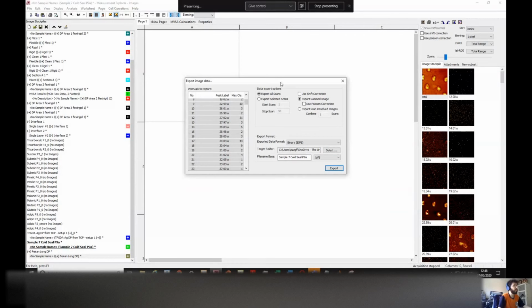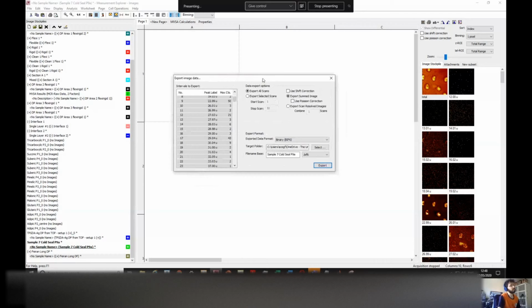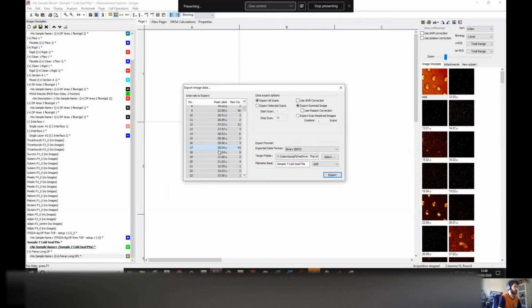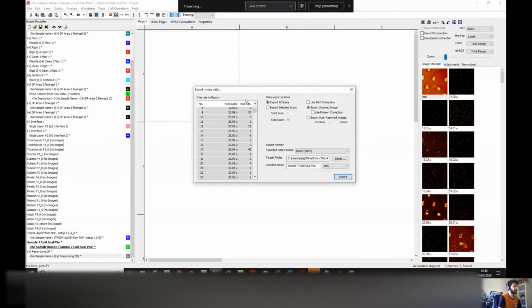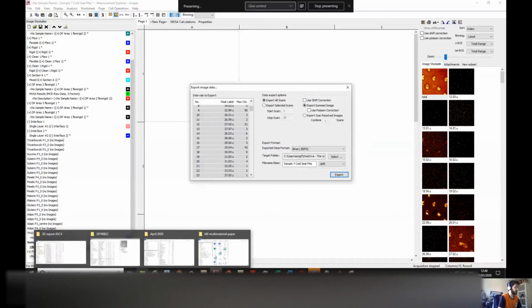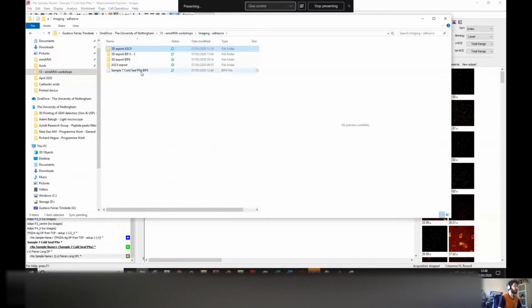It will not tell you when it's done. So what I do is, whenever I can move this window again, it means it's been exported. For some large data sets, it takes a while to export. So try to move this window. I think that's the quickest way to test whether or not it's been exported. If you go to the folder, you see it created a single file, which is like 12 megabytes, containing all the maps from your ions. So one map for each ion.